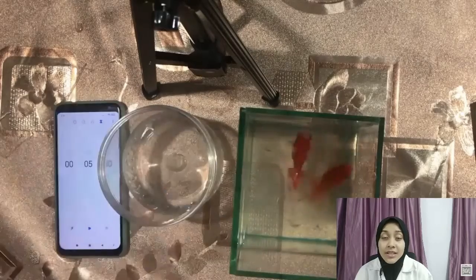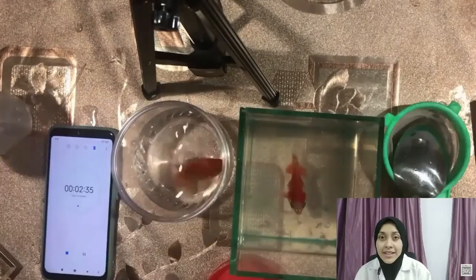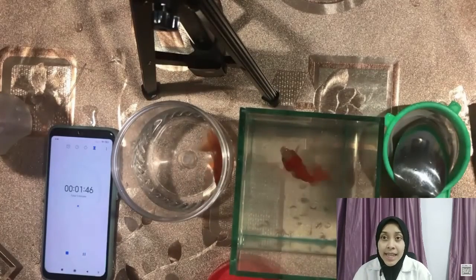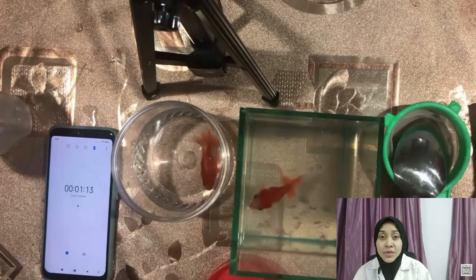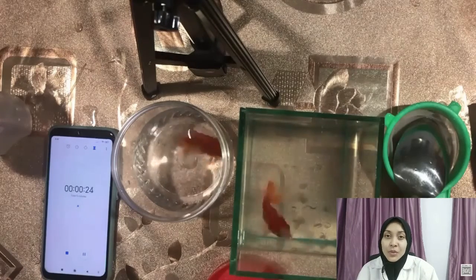So the method is, first, a plastic glass was filled with 200 ml of normal temperature water. Second, the goldfish was placed in the plastic glass by using a spatula and water filter. Third, the number of breaths in 5 minutes was observed and recorded, and steps 1 to 3 were repeated by using 200 ml of cold water.